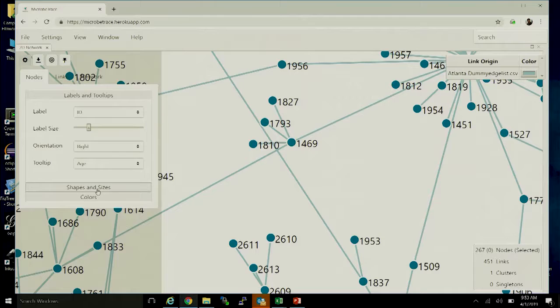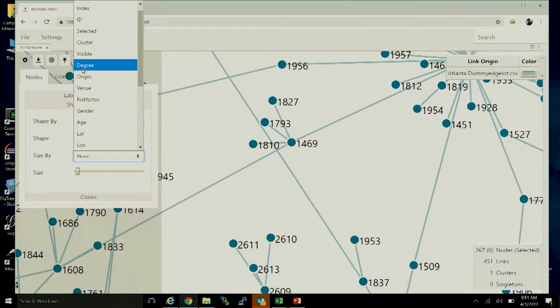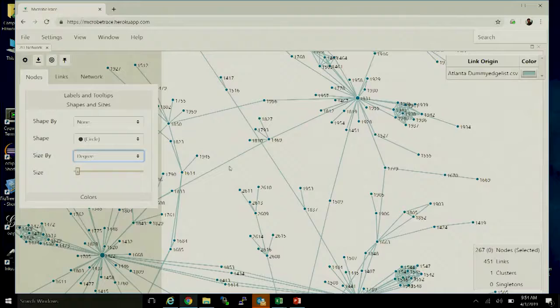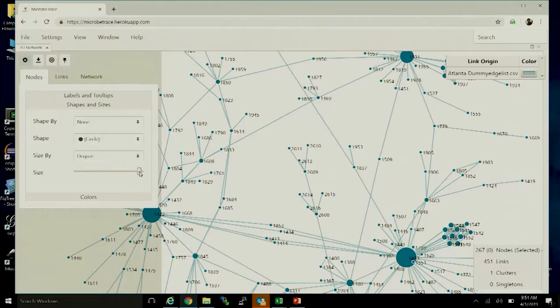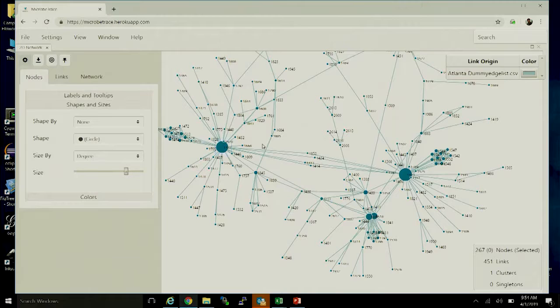We can also switch to shape and sizes. We automatically calculate the number of neighbors in the network, so you can size by degree. Degree is a commonly used term in network science indicating how many neighbors a person has. Sizing by degree, you can drag the slider bar and see that individuals with the most neighbors are most visually apparent on screen.